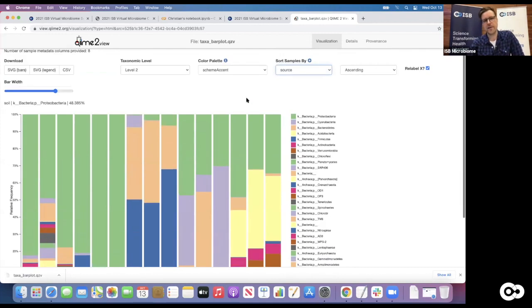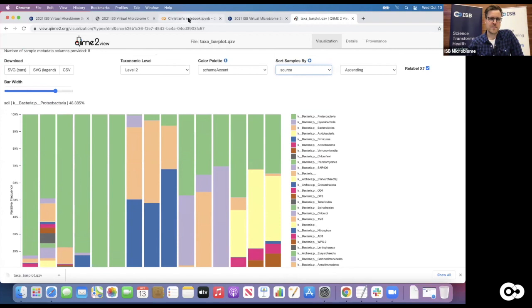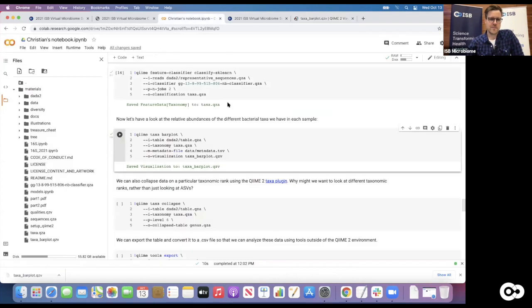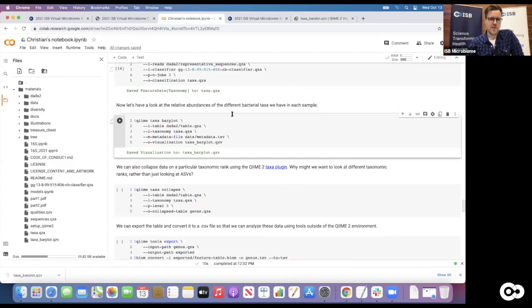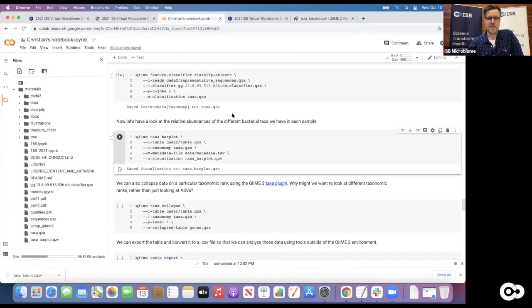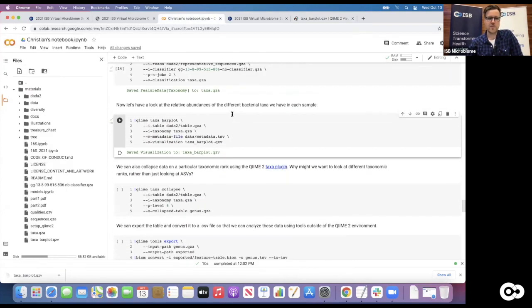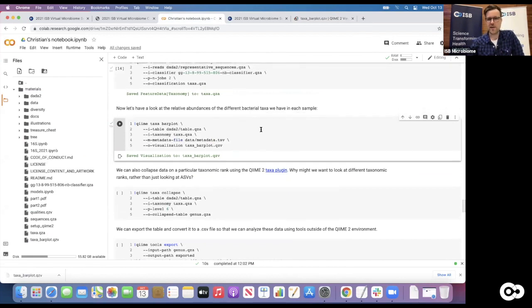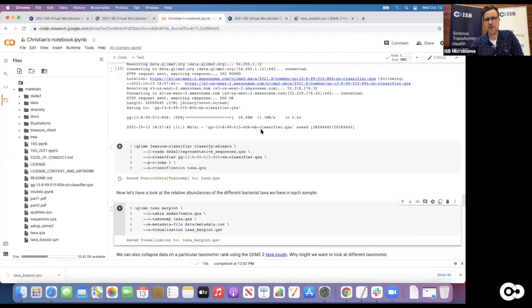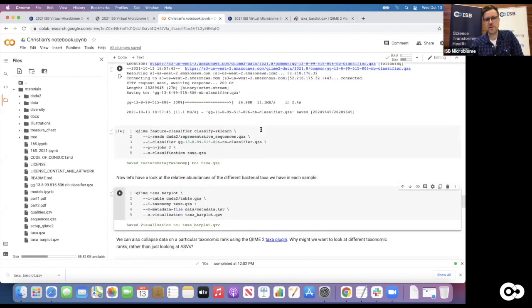And then finally if you look at the soil, we actually see Acidobacteria - definitely very specific to soil - as a phylum, along with high levels of Actinobacteria, Verrucomicrobia, and again some Proteobacteria. So there are definitely certain taxonomic signatures that are really scaling with environment.